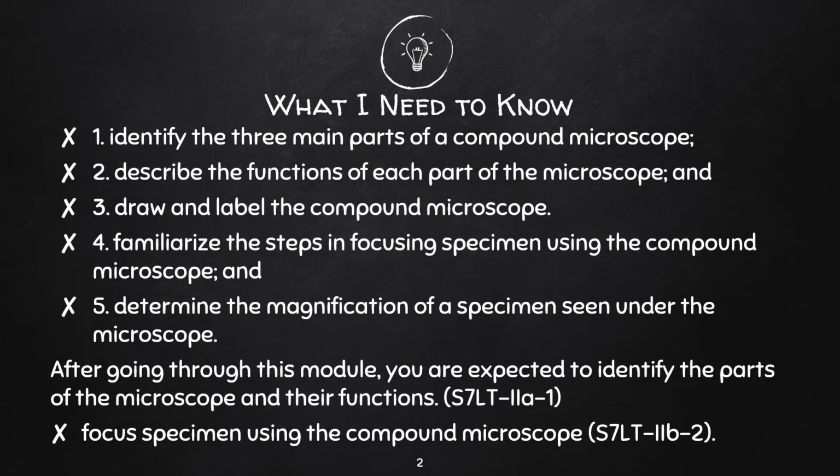Ano nga ba yung mga objectives natin for today's video? Yung main objective natin is, of course, after going through this video, you are expected to identify the parts and functions of the microscopes. Yung ikalawa naman is to focus a specimen using the compound microscope based on the given steps.